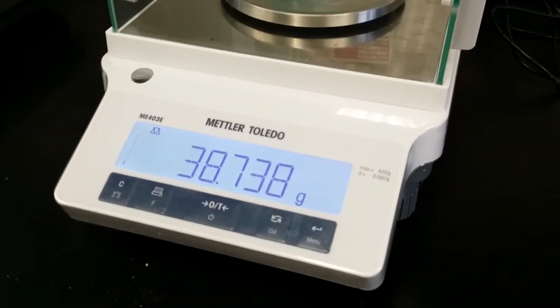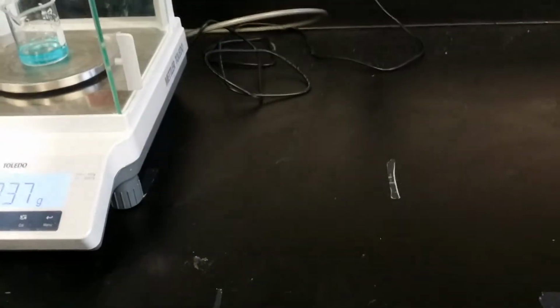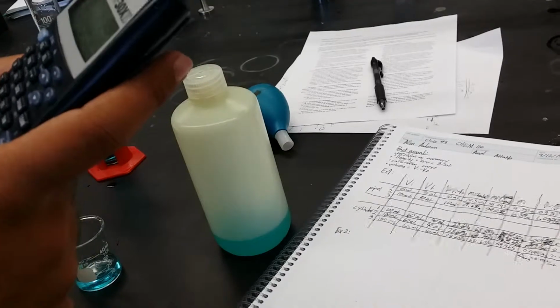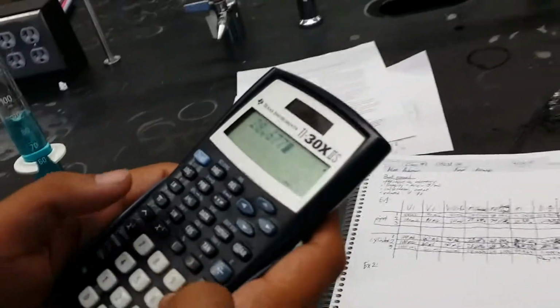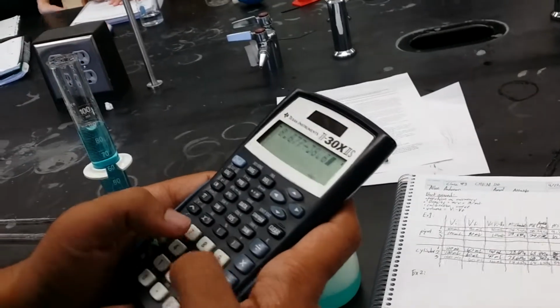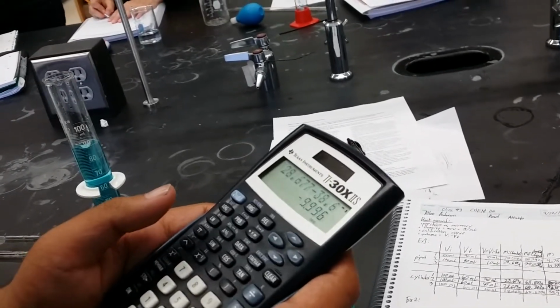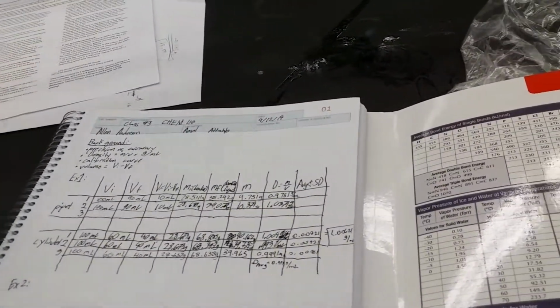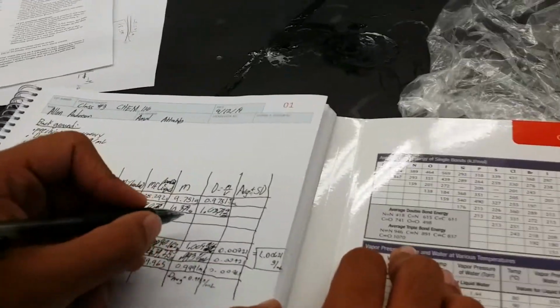And that's 38.673. Okay. So now, let's head back. The weight of the beaker itself is 28.677, so we gotta calculate that real quick. 38.673 minus 28.677 is 9.996, divided by 10. 0.9996. There we go. So, density.